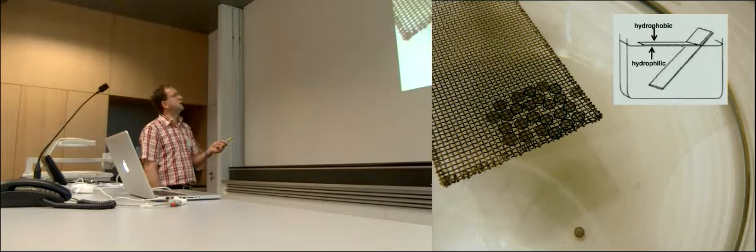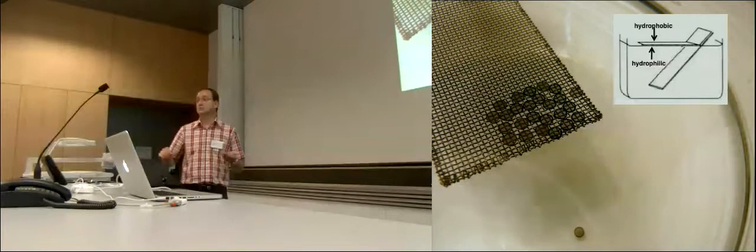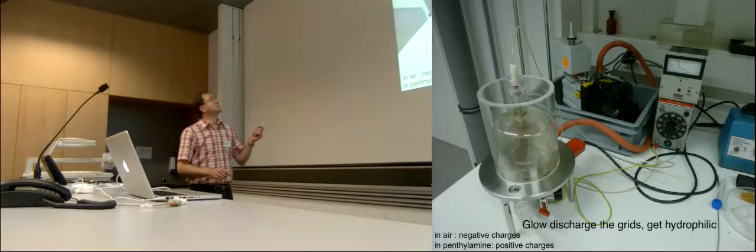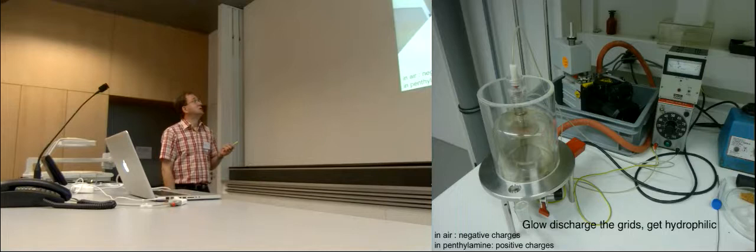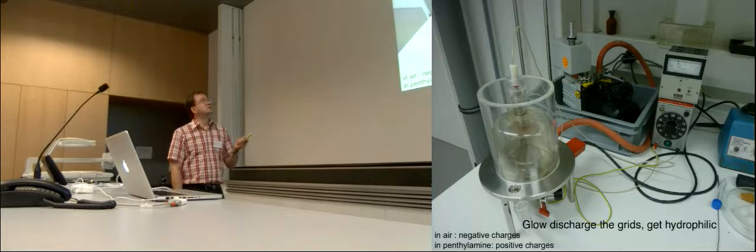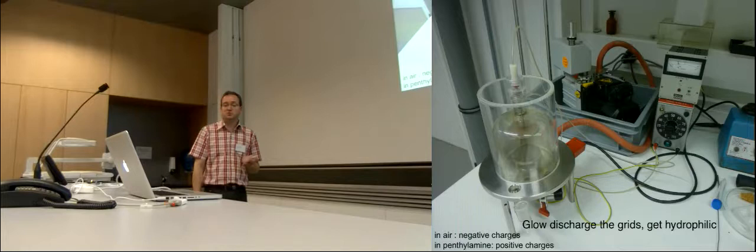Here, you cannot really see, there is a very tiny... here, this is the edge of a carbon that is very thin, like only 10 nanometers or 5 nanometers carbon. The grids are on the net and they are underwater. You let the water level down and the carbon gets to stick on the grids. And then you take your grids and let them dry and use them later for the freezing. If your grids are dry and you want to bring a sample to the grid, the grids have to be rendered hydrophilic with the use of a glow discharge machine. In a vacuum, a low vacuum, you can get with a high tension some glowing that will charge your grid, either positive or negative depending if it's in air or in a polyamine or in a medium like pentylamine.